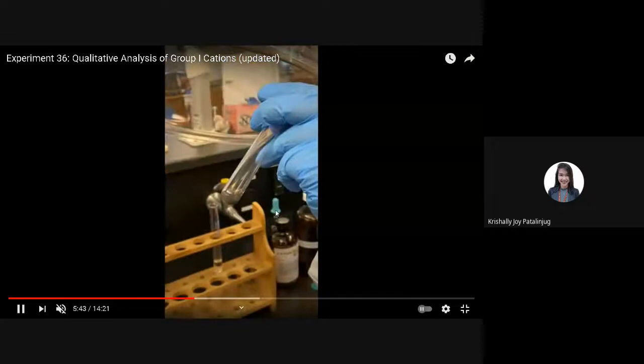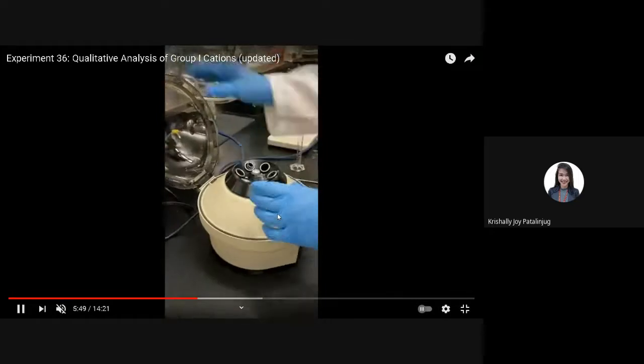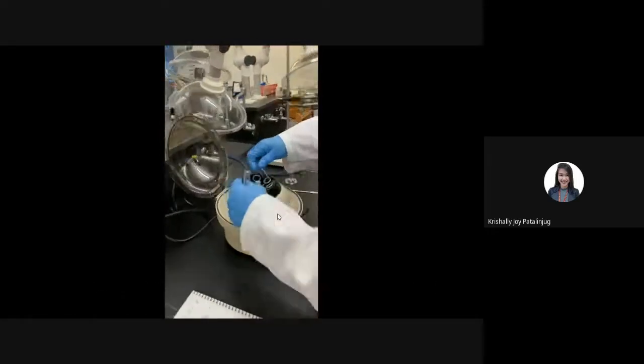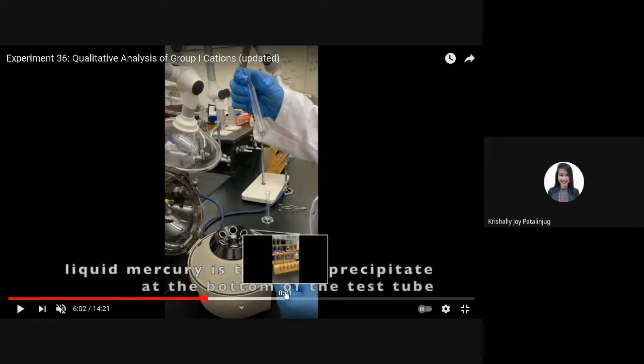Excuse me. So, na-separate out natin si mercury. Okay, si mercury ion, forming black particles. Okay, yung black particles actually, that is the mercury metal. When you say mercury metal, that is only Hg. Oh, ayan, it's the liquid mercury. Okay, the mercury metal, that is the black precipitate being formed.